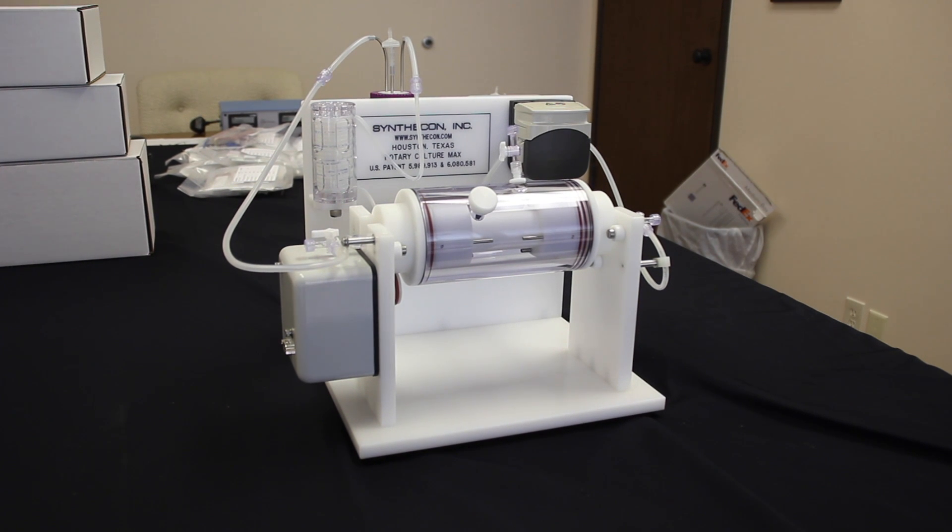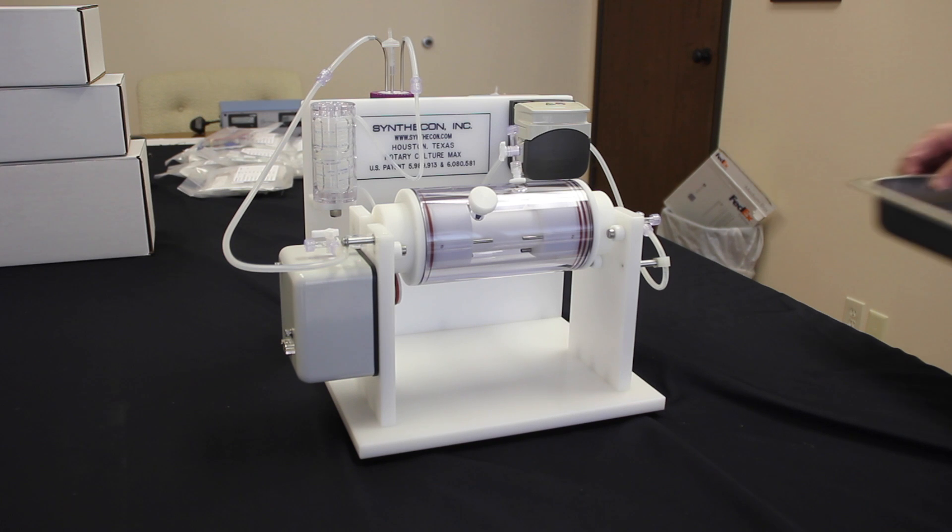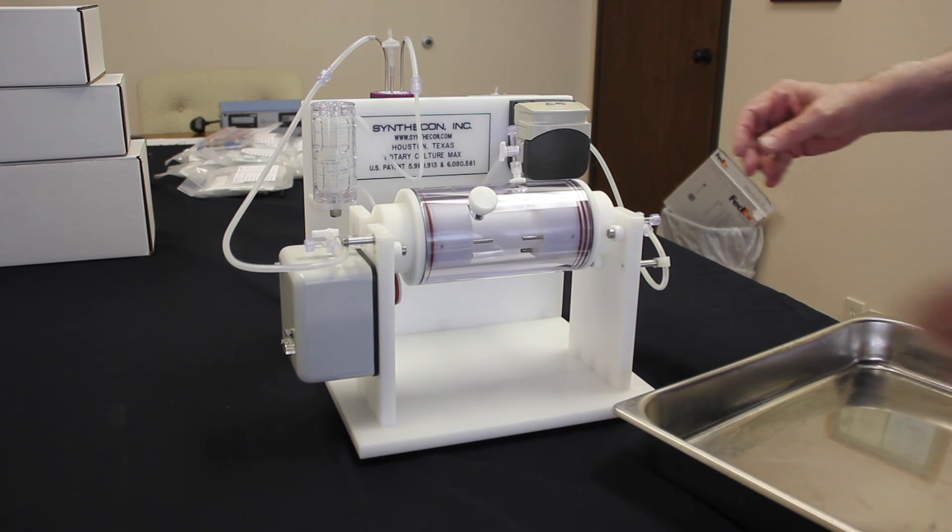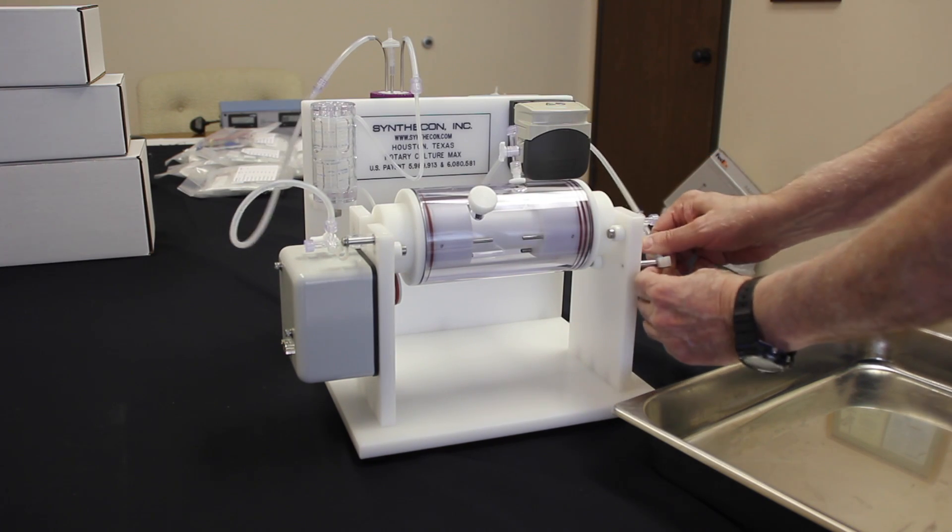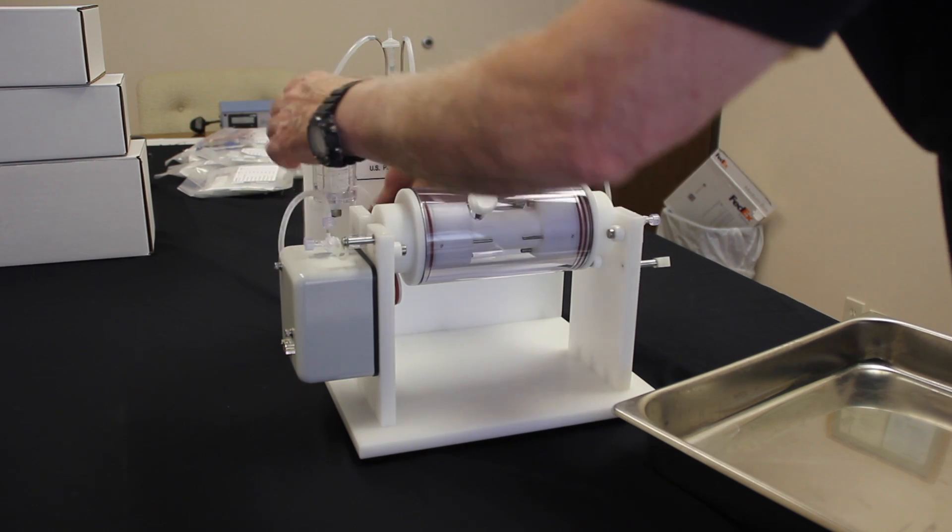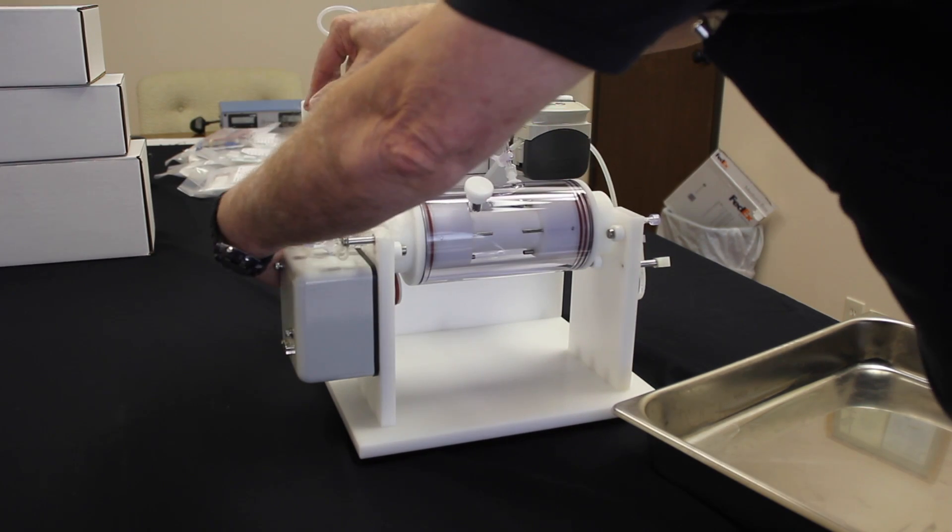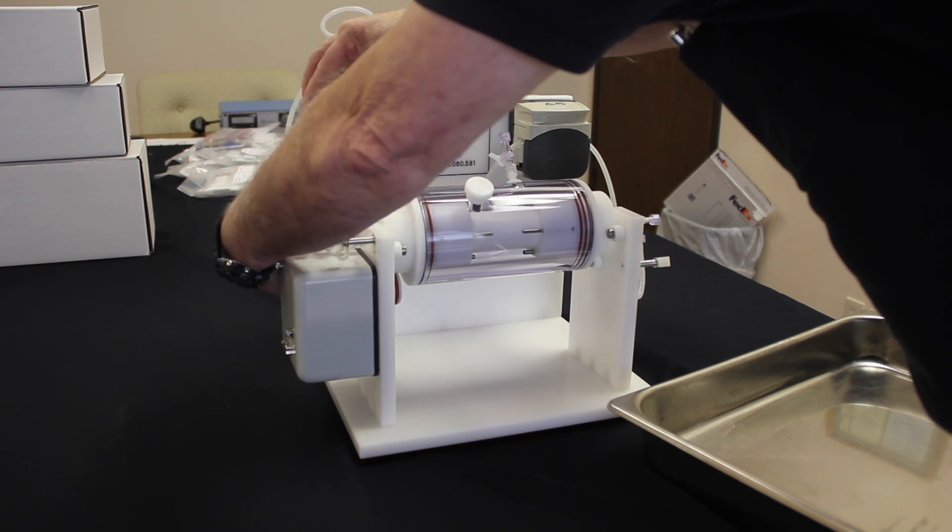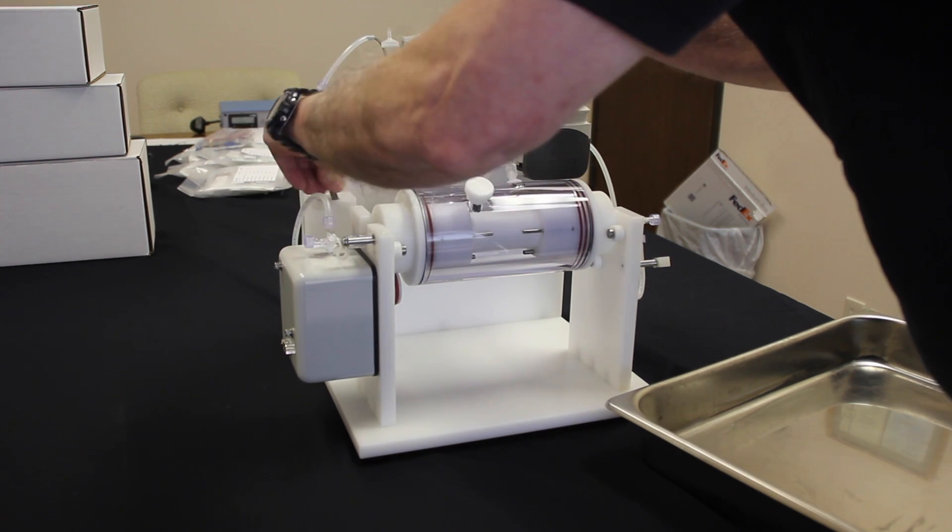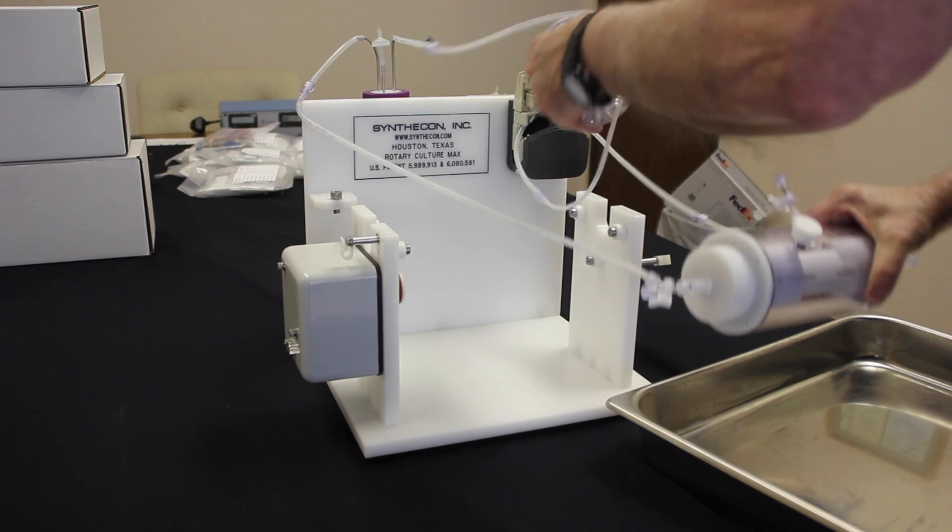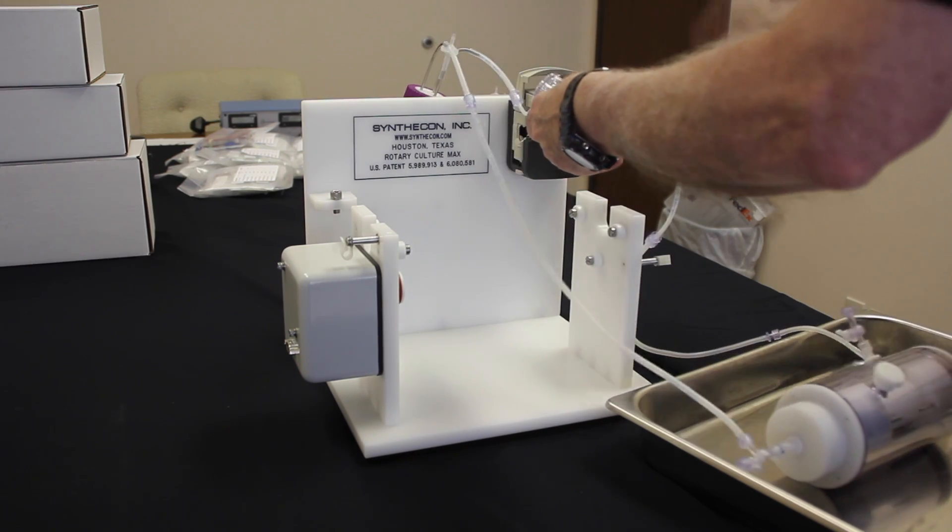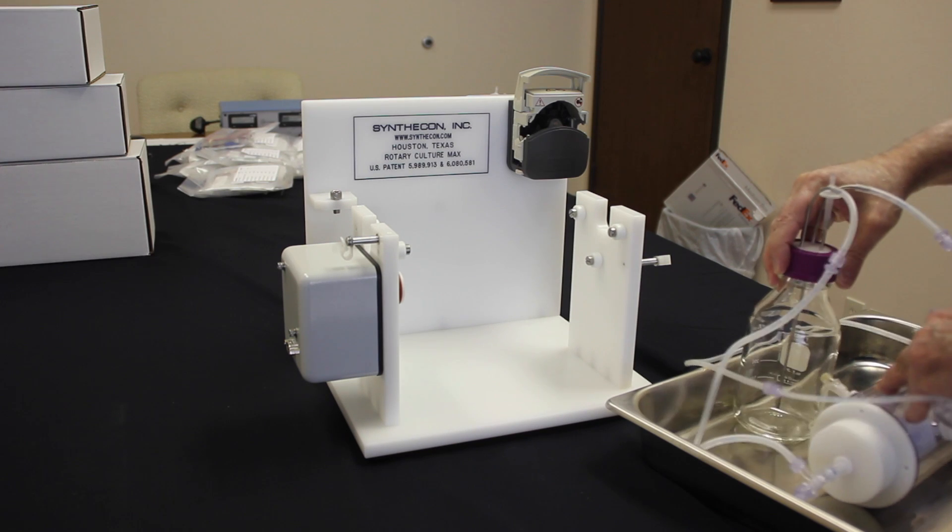So now, the vessel has been operating and you've had your culture and you're ready, after however long, to change the media. First, you can use your tray to either remove the entire rotator base or merely the whole flow loop off of the rotator base. This assembly will then be placed in your tray to be carried to your hood to swap out the media. It is important that the entire assembly is removed to maintain sterility.